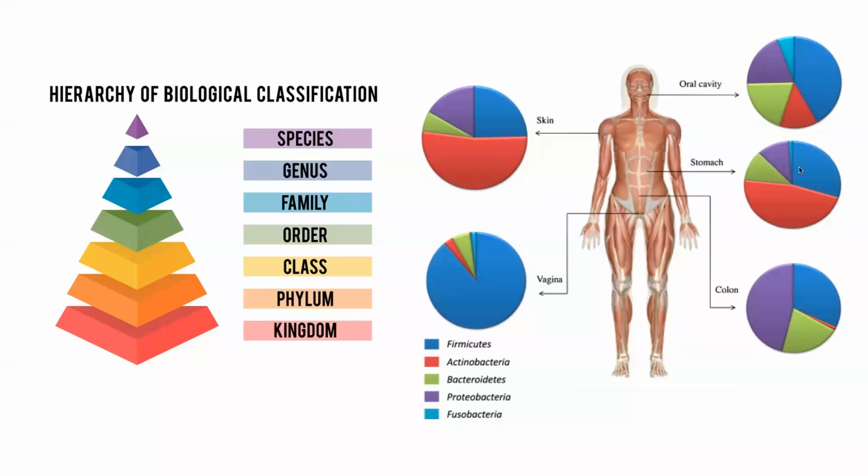Okay, so another question, how to optimize the amplification protocol regarding the number of amplification cycles and input DNA. So what may be a good discussion for us to have is to better understand exactly what it is that you are trying to sequence and what your objective is.